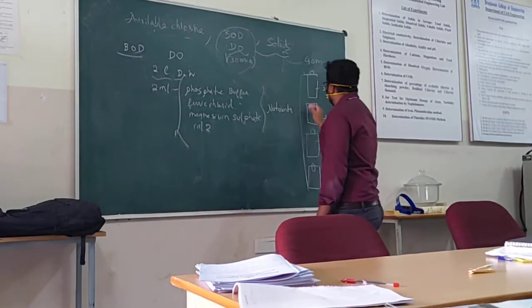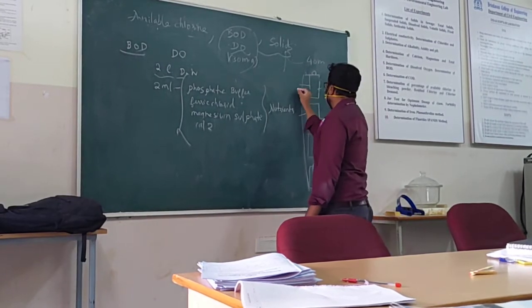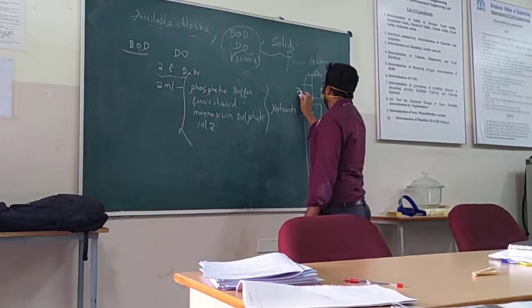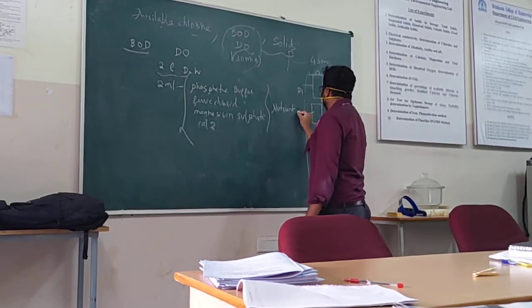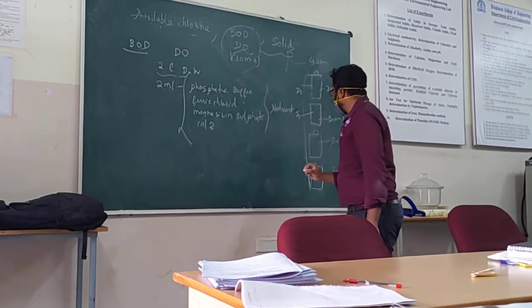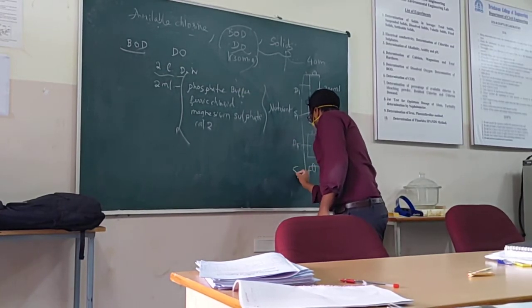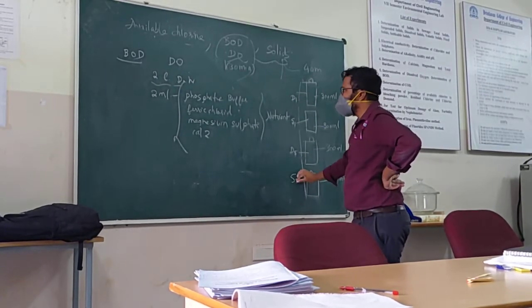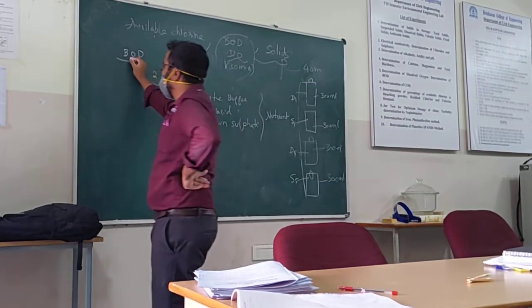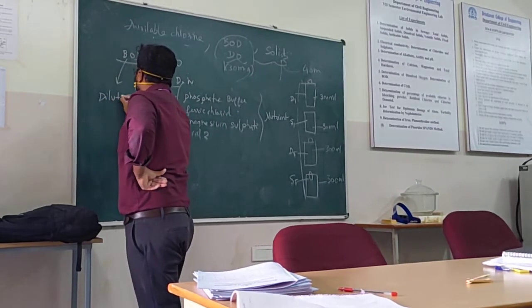Now, the bottles I will label as D1 and this one as S1, and this is D5 and this is S5. So what this means is to find the BOD, the method we are using is dilution.